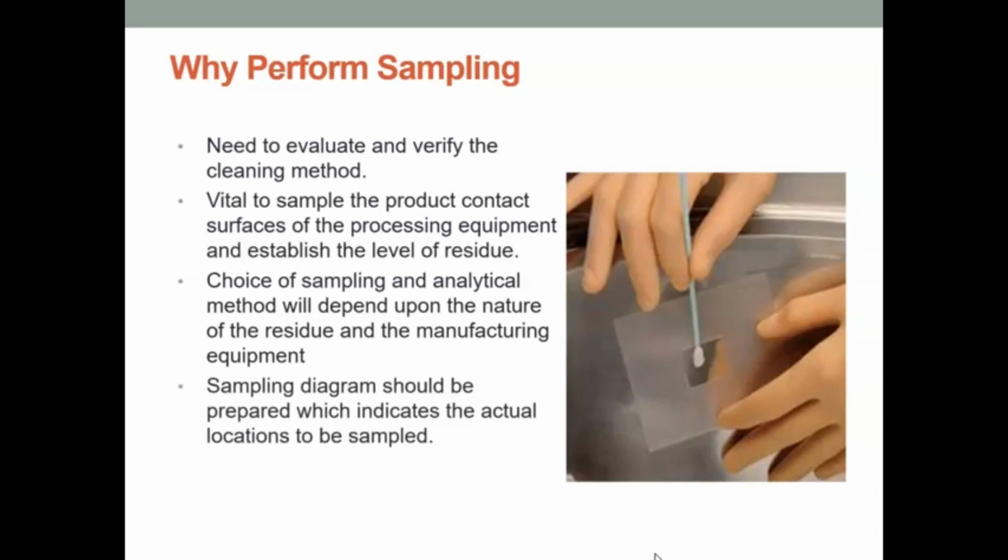Sampling diagrams should be prepared, and these will indicate the actual locations to be sampled and the methods for sampling also. Critical areas or areas that are difficult to clean are particularly important to sample.